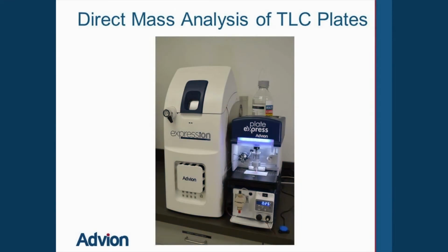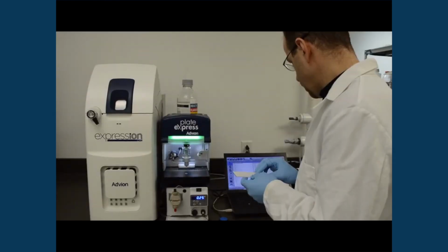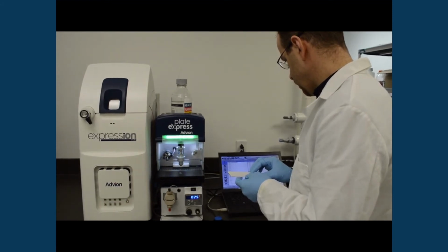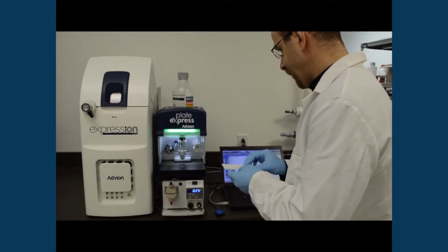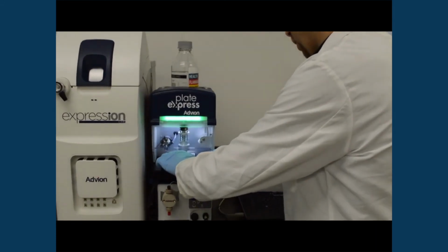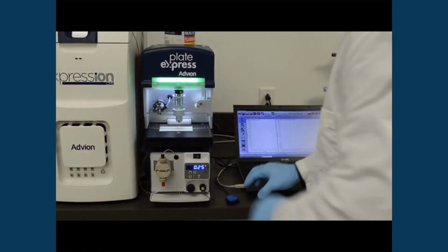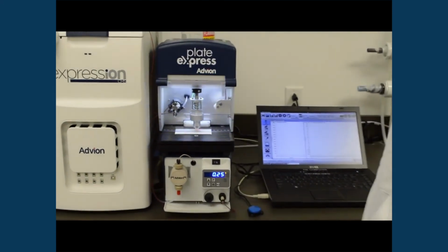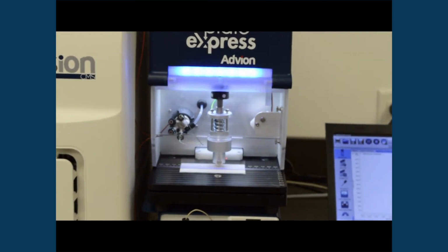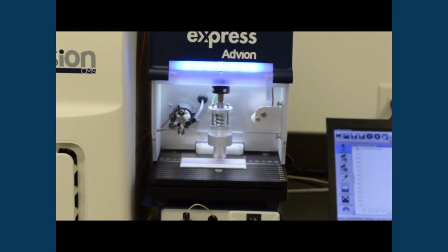Direct mass analysis of TLC plates using the Plate Express plate reader coupled with the Expression compact mass spectrometer. The green light indicates the instrument is ready for use. Begin by placing the TLC plate onto the stage. Align the spot of interest below the red dot. Begin by depressing the blue button. The head will lower and the blue indicator light will flash.